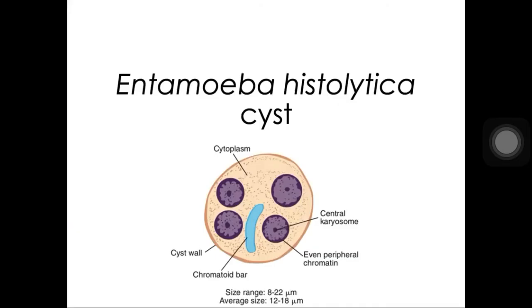Okay, so dalawa lang po pala yung image natin doon. Okay, so this one basically is the Entamoeba histolytica cyst. Nakuha po ba yun? So the cyst of Entamoeba histolytica may have 1 to 4 nuclei. So yung pinaka-mature na form po niya will have 4 nuclei. So 1 to 4, it will vary. But in mature form, it will have a quadrinucleated cyst consisting of 4 nuclei.